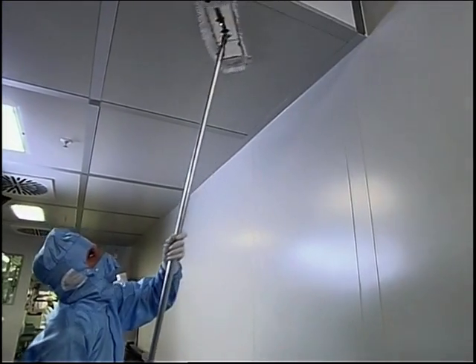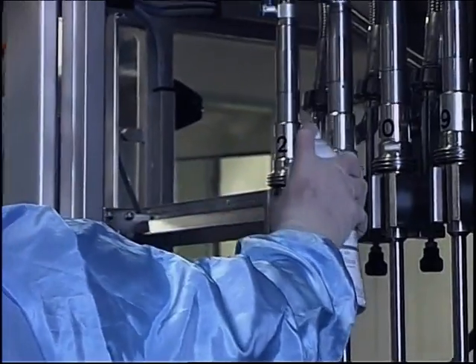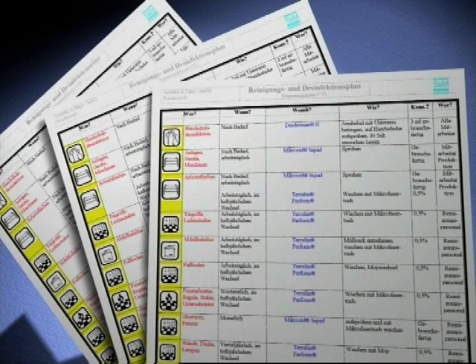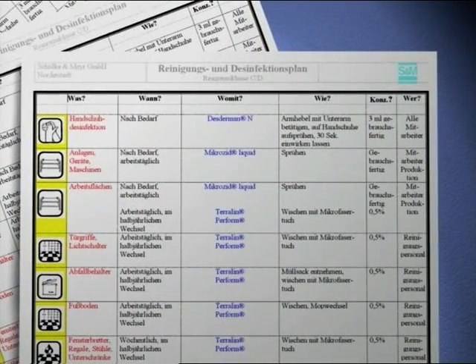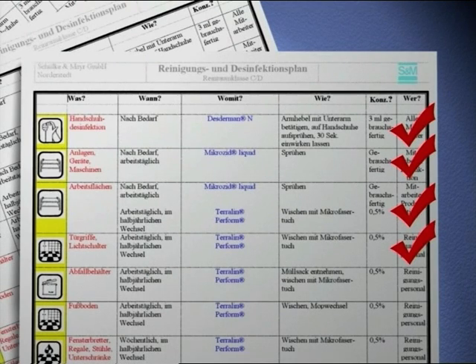An individual hygiene plan is prepared as a guideline for the individual activities, which can vary widely depending on the company and the department. This plan is binding for the staff concerned. Every step is described exactly and, of course, must be strictly adhered to. So, always study your hygiene plan carefully, because the required hygiene status can only be maintained by well-organized cleaning and disinfection measures and exact compliance with the chemical and technical processes.